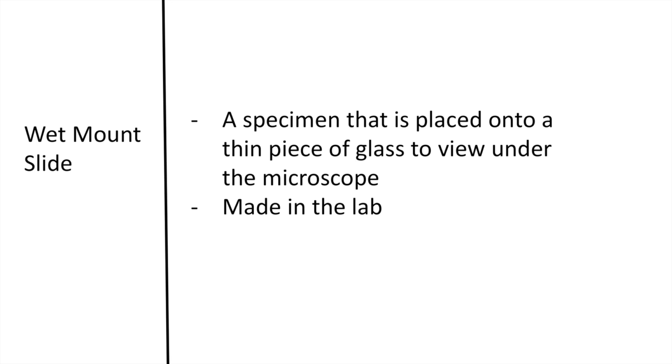Now, a wet mount slide is a specimen that is placed onto a thin piece of glass called the slide that we view under the microscope. The difference is we do not purchase these from a company. We make these in the lab, so these are more fresh.